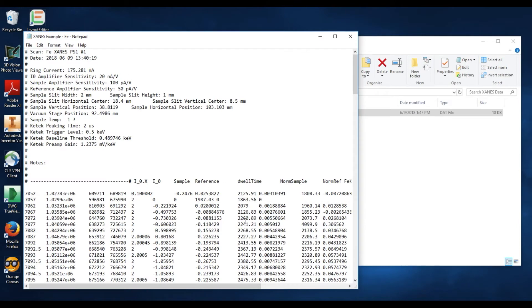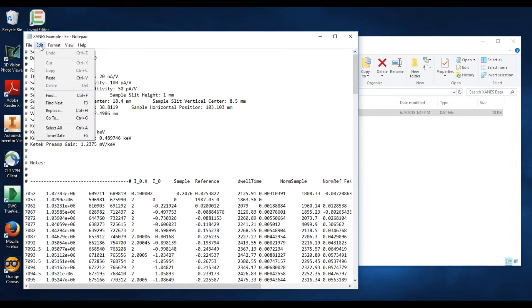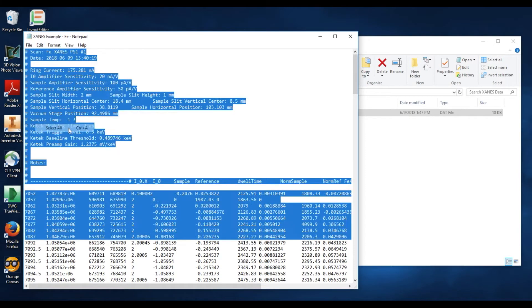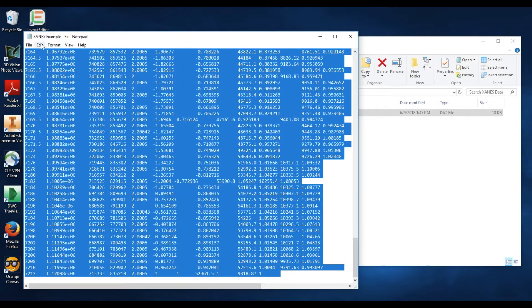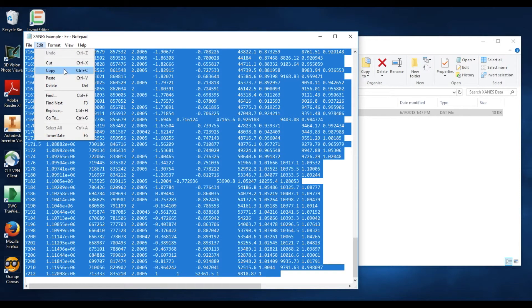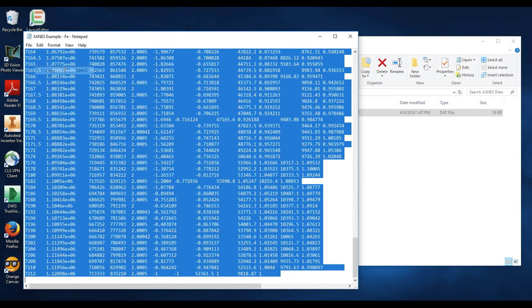Now we would like to copy all of this data and paste it into Excel. So to copy it, go up here to the top left under the Edit menu and select the Select All option. Back under the Edit menu and select Copy.